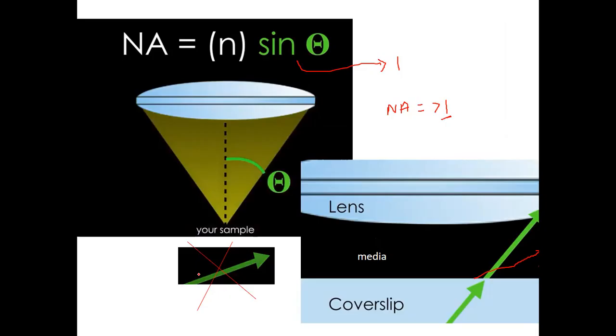Because of this numerical aperture, you can visualize the magnification, that is the enlargement, and the brightness in a better way in your microscope. Otherwise, it is not possible. So theoretically, they have produced it and they have constructed the microscope in this format.